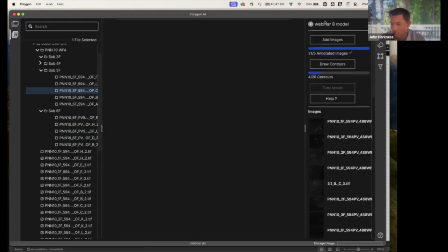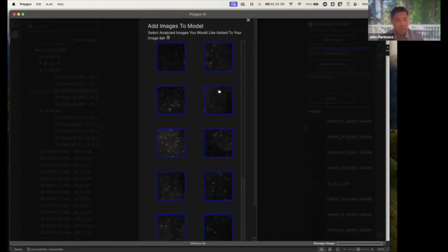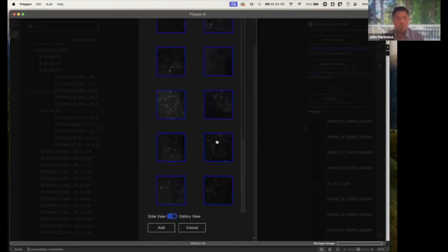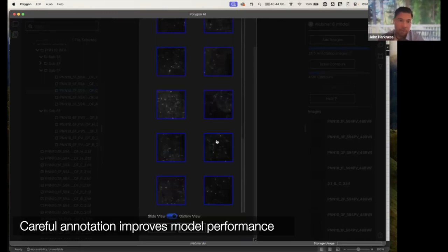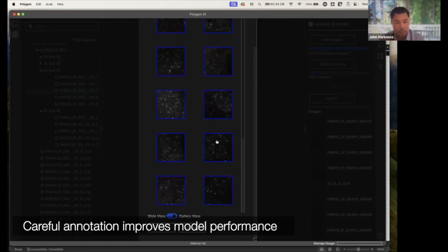So back into my webinar model, what I can do now is I can add all the images that I've already approved from my project. And probably the most important thing to think about here is we're training a model really the same way you'd train any animal in a behavioral experiment. We want to be very specific and very consistent with what we show it.